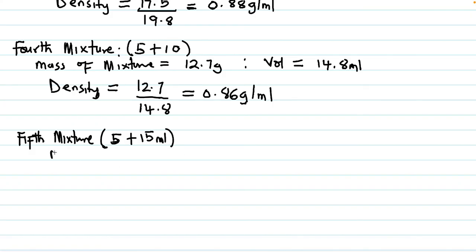The mass of the mixture is 16.81. Remember, there are ranges your value should follow.